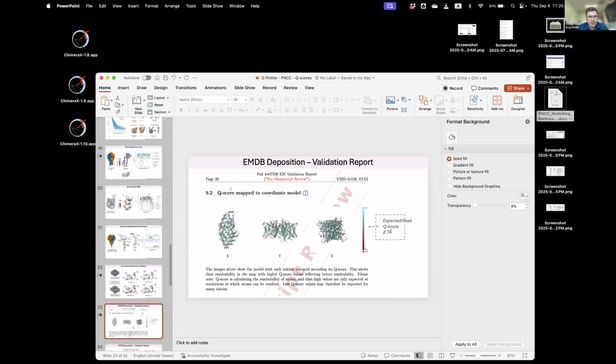Okay. Why shouldn't we refine dihedral angles? Going back, okay, this is an amazing question, and it has to do with validation. Technically, it shouldn't be necessary to use dihedral angles in your refinement because the proper dihedral angles should come out of the other parameters, the bond angles and bond lengths, which are well characterized for those atom types. And it was actually introduced as a validation score.